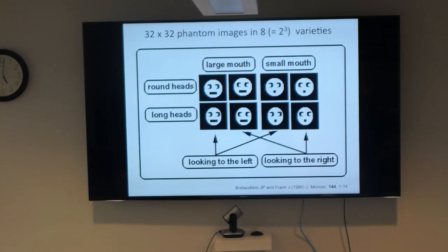But with SPIDER, you had a workbench. You could teach image processing by saying, do these operations in this order, or solve this problem, and given these commands, people could do this, and they would learn in the process. Right now, we have nothing of that sort anymore. And so we need to reintroduce this kind of workbench, so that people have a very solid conceptual knowledge. Right now, I see it's out of the window.